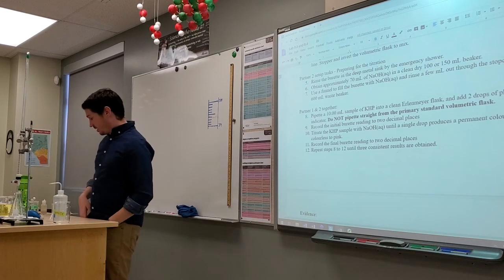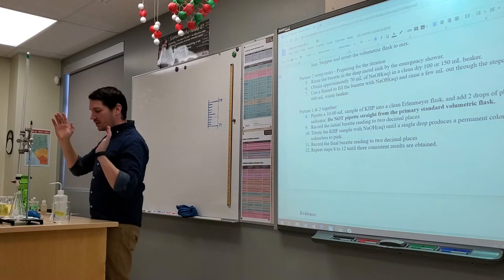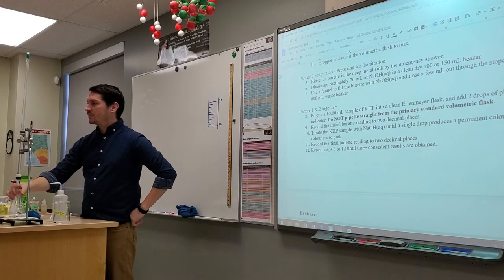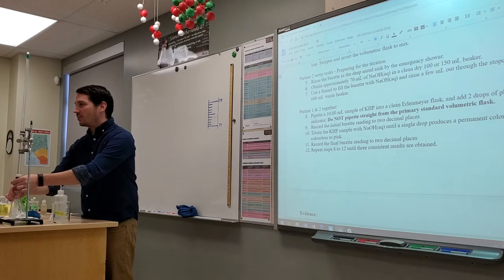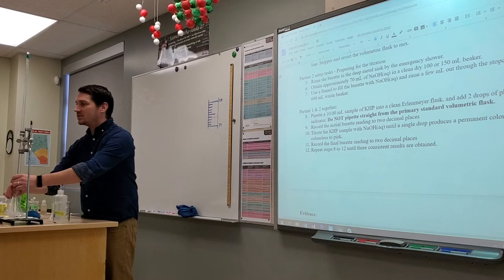So we're gonna dump this. What you should do, and I've never shown you this before, but with your dominant hand, you swirl. Are you right-handed or left-handed? I'm right-handed. I'm gonna swirl with my right hand, and I'm gonna use my left hand to operate the stopcock. The first one, you're always gonna screw up. So just add it as fast as you can and stop when you get a color change.